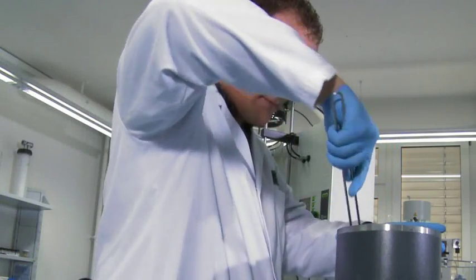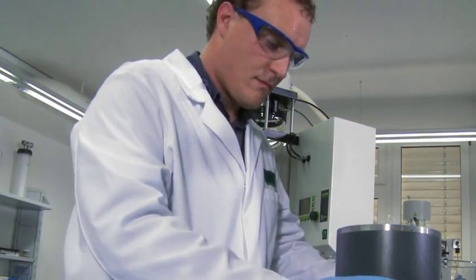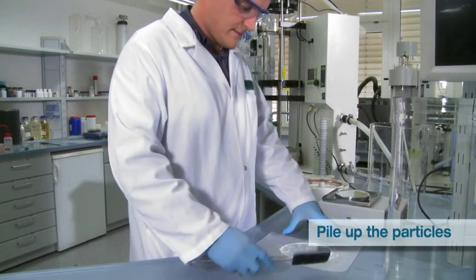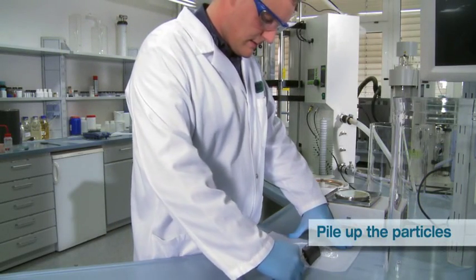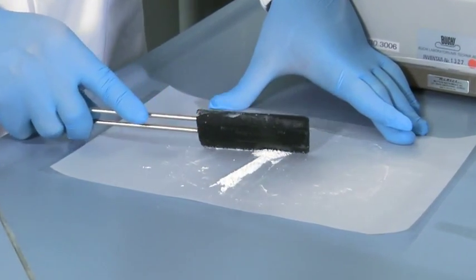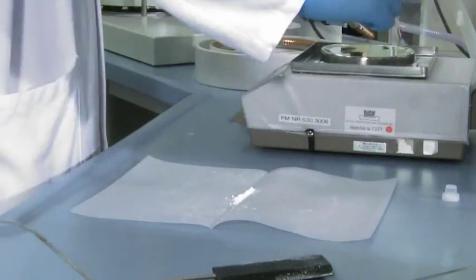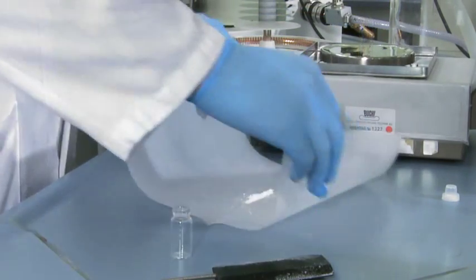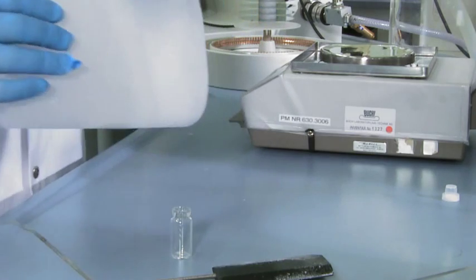Notice that the collection tube must have reached room temperature before doing this. Pile the particles together on the collection paper with the scraper. Finally, fill the particles from the collection paper into a pre-weighed container.